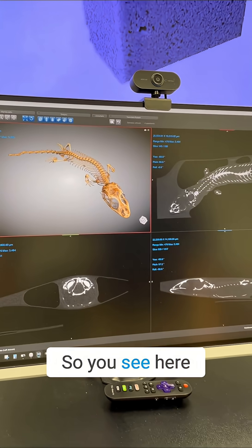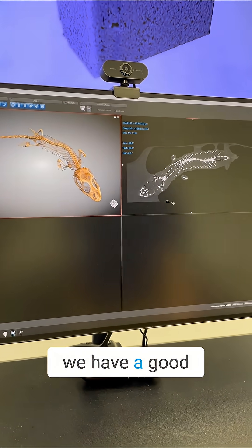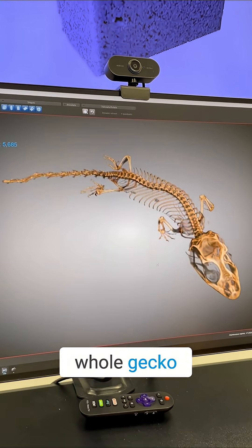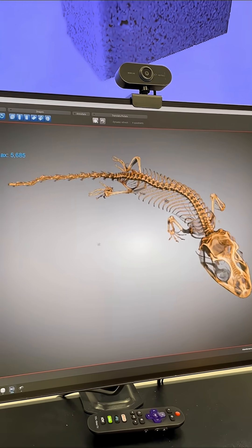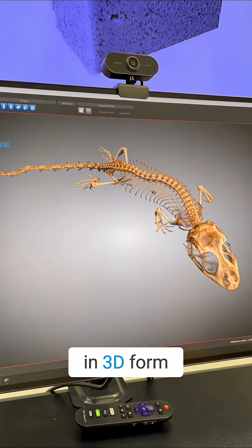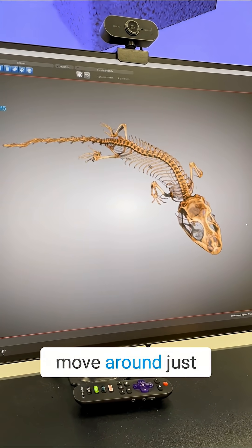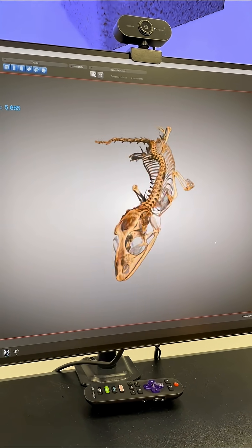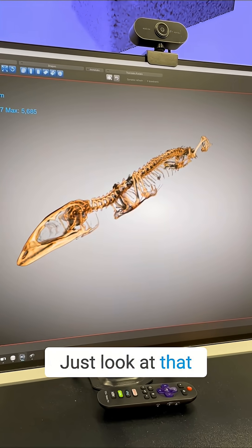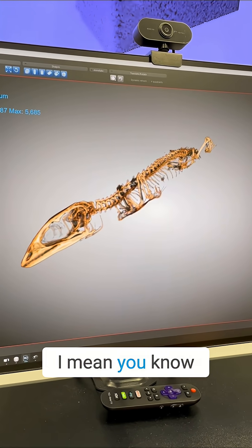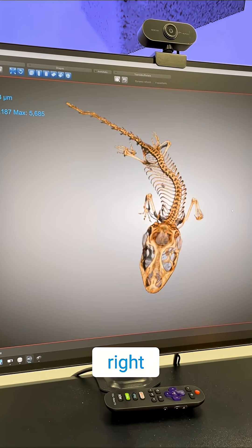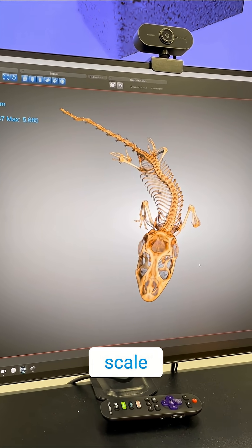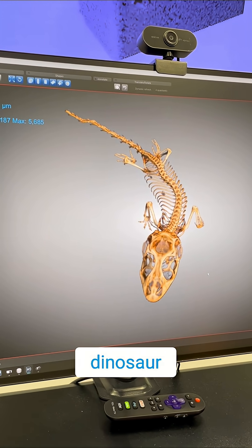So you see here, we have a good capture of the whole gecko in 3D form, and you can just move around — just look at that. It's always fun to look at CT data. Without a scale, it looks like a dinosaur.